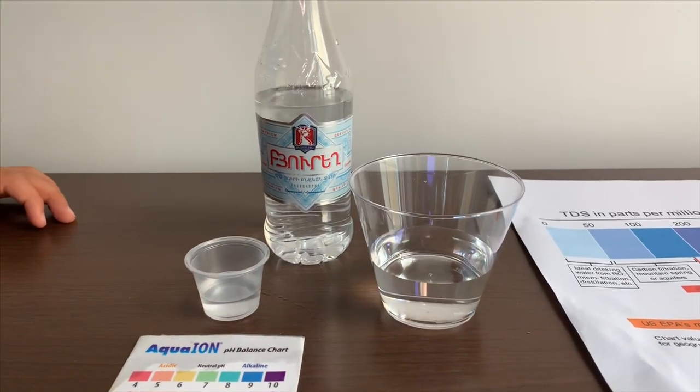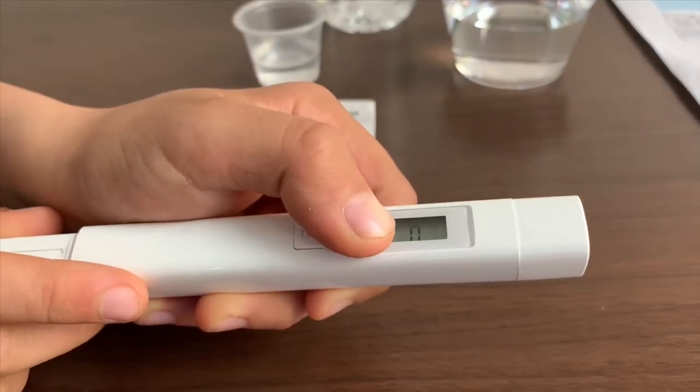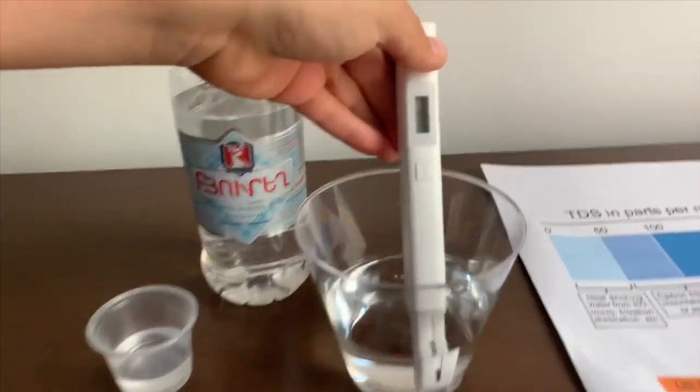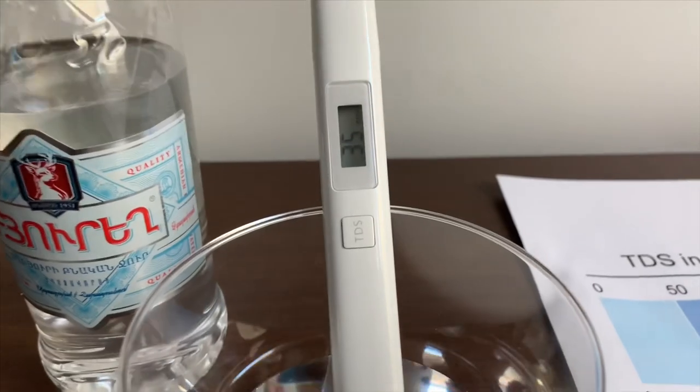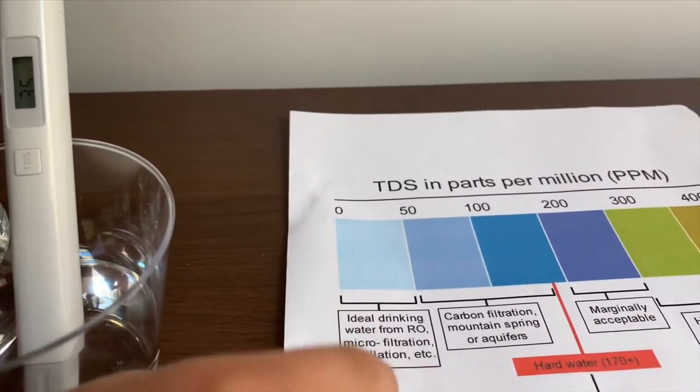First, we're going to test the TDS level. Turn on the TDS tester, make sure it says zero, and put it in. 35. That is ideal drinking water.